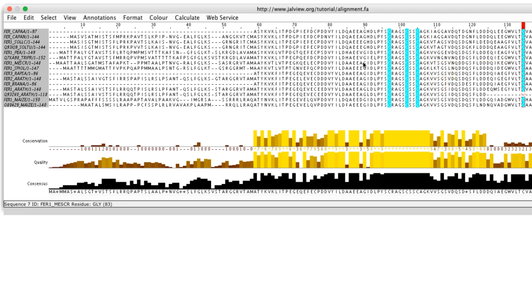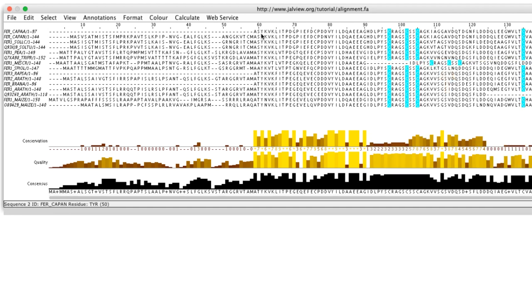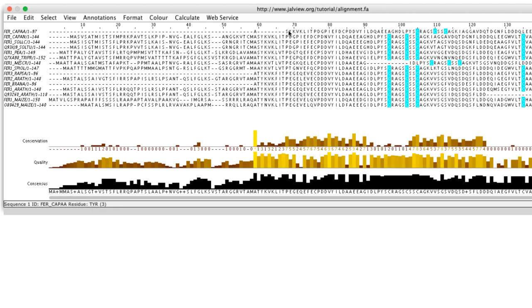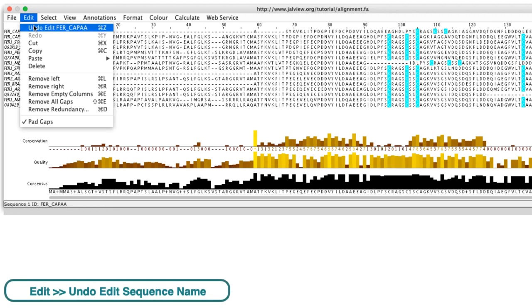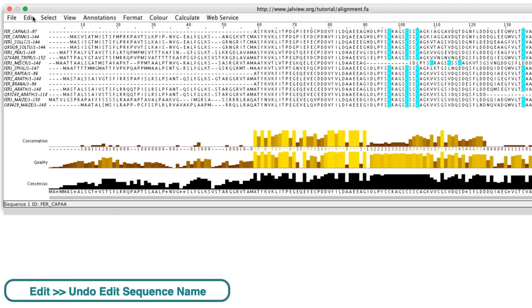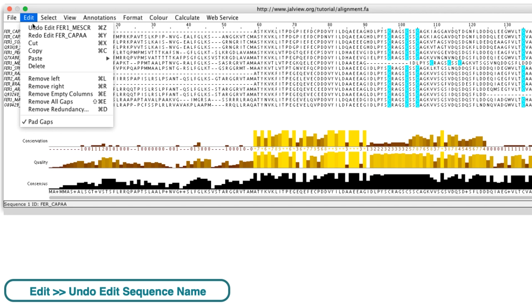If I insert gaps into the sequence, the feature moves with the sequence. I will delete these gaps using the undo option in the edit menu.